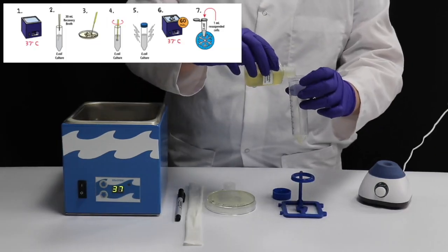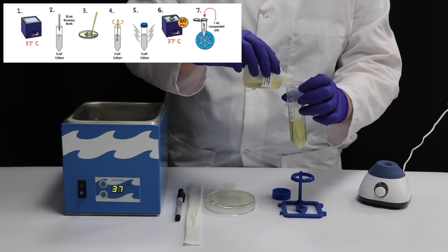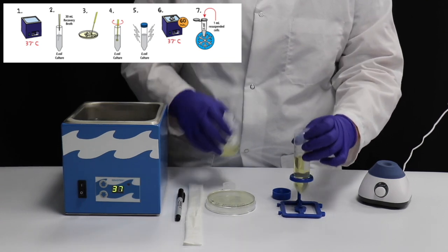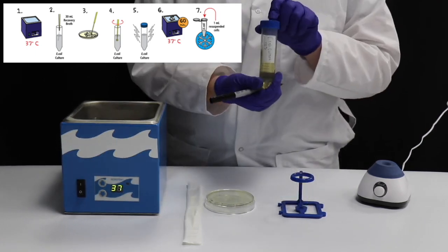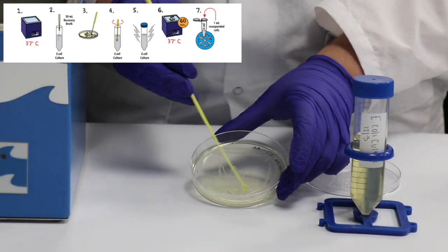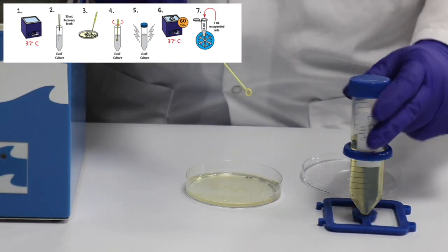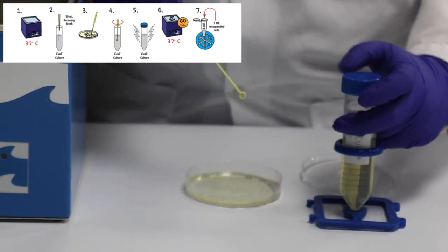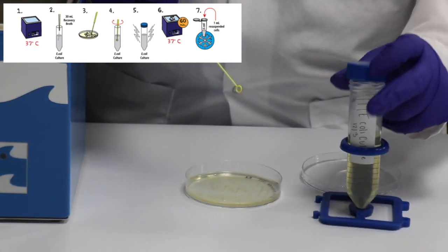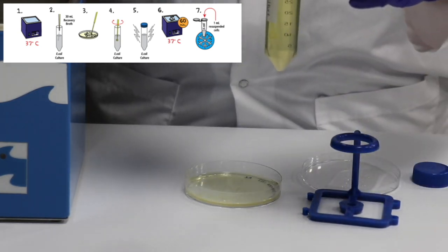After your water bath reaches 37 degrees Celsius, add 30 ml of recovery broth to the 50 ml conical tube and label it E. coli Culture. Swipe the sterile inoculating loop through a dense section of the bacterial culture — about a match head sized amount of bacteria — and re-suspend by twisting the loop back and forth until all the bacteria has been removed from the loop.